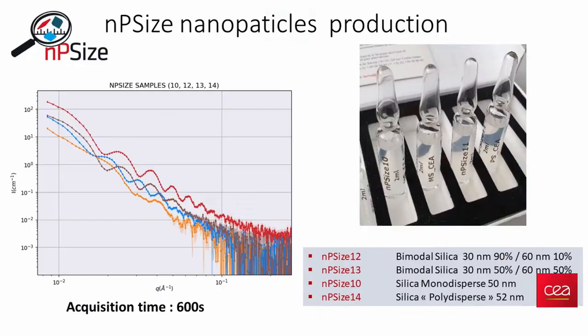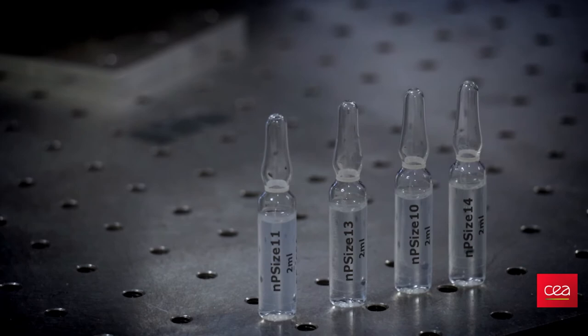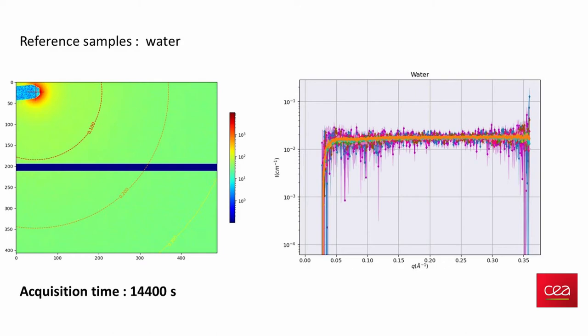We use this homemade instrument to help us in the characterization of silica nanoparticles synthesized in the EMPIR project. We can obtain a good estimation of the nanoparticle size with a counting time of around 1 minute. The typical time to have a better signal is 10 minutes. Even at this acquisition time, the water signal is very flat.